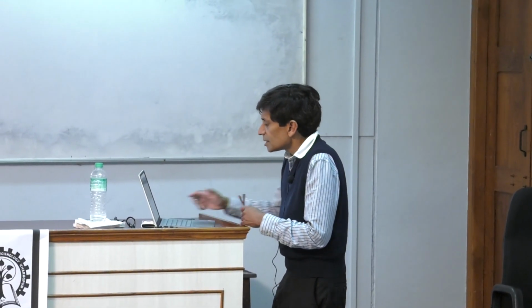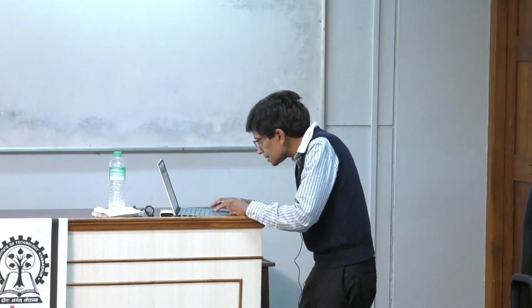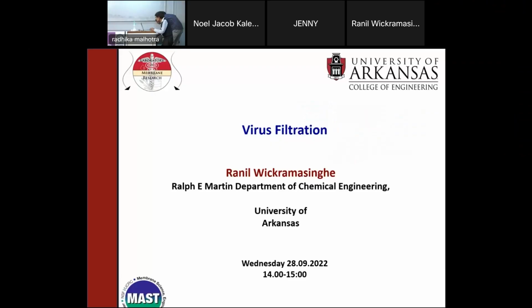Okay, let's talk about, so I wanted to make a small change today. I was going to initially talk about membrane adsorbers right now and virus filtration this afternoon. I'm going to switch the order, because virus filtration is also a pressure-driven process, so it fits well with what we've talked about so far, and then membrane adsorbers is something completely different, okay? So let's do it that way. So virus filtration. So let's continue.